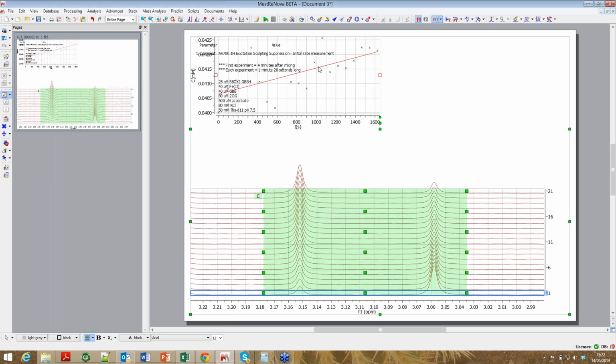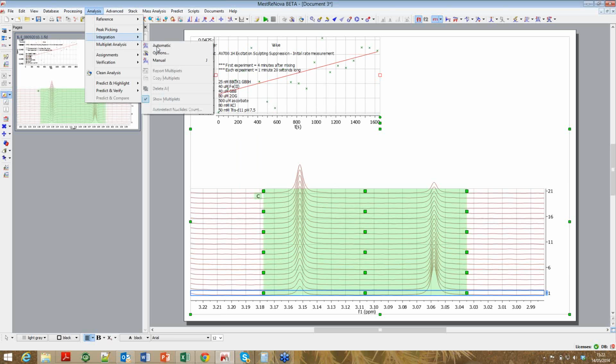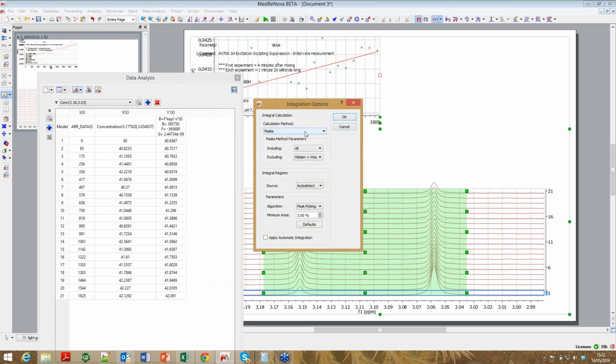Okay, and that should be relatively constant across the spectrum. Okay, now just close your eyes for a second. I'm going to change something, and then we'll have a look at it again. I need to reset this.